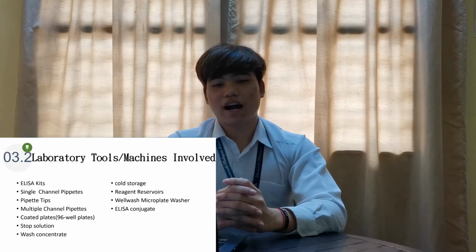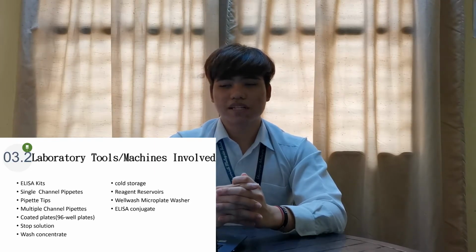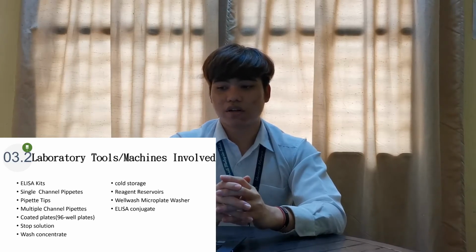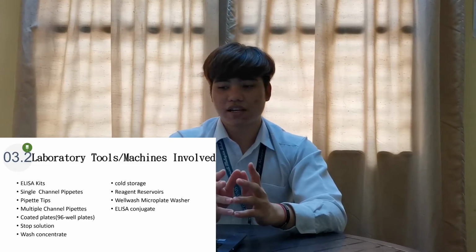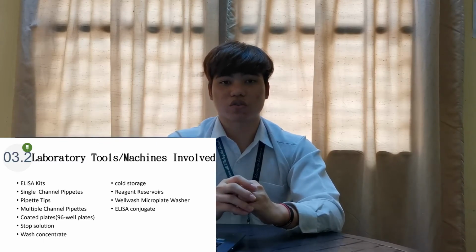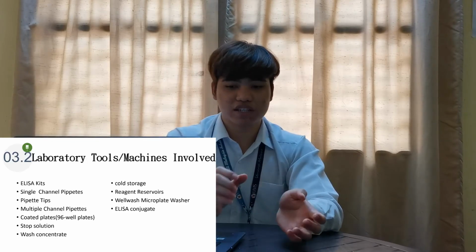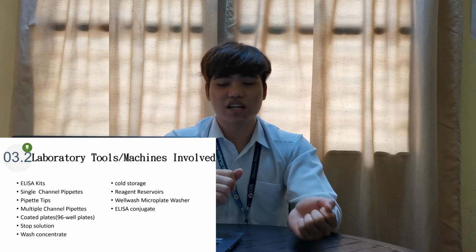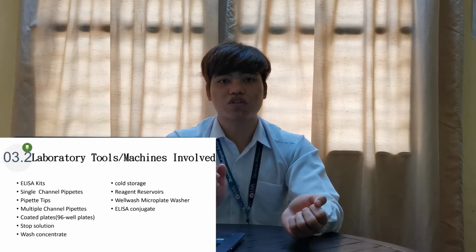For the next part, I will explain the laboratory tools and machines involved. Basically, there are many machines involved in these assays. For example, cold storage for the samples, the reagent reservoir, and microplate washers that wash out all the solutions. Then ELISA conjugate. There are also kits involved: ELISA kits, single channel pipettes, pipette tips, multichannel pipettes, plates, 96-well plates, stop solution, and wash concentrate.